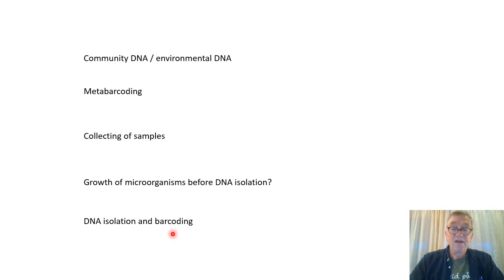The barcoding, maybe it was a little confusing to say barcode here because we also call it metabarcoding, but barcoding is also used as a word for tagging the DNA, because now you are several groups, or you will work one by one, so you have 8 or 9 groups today, and then you will have 8 or 9 different samples.